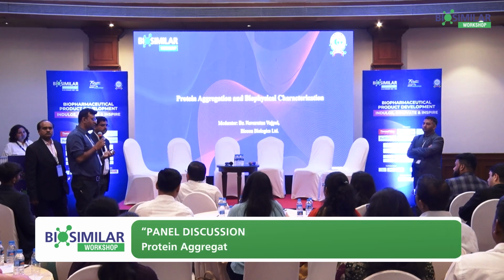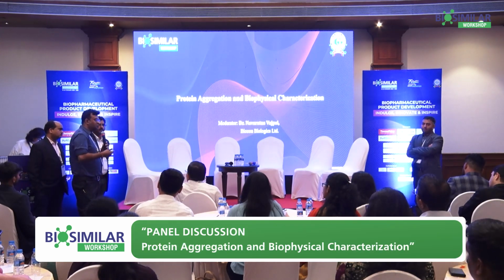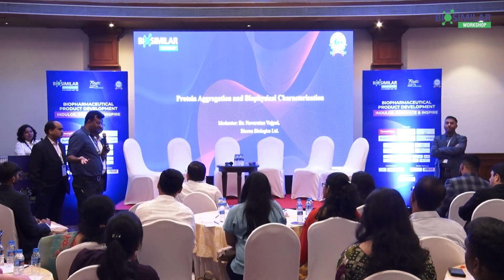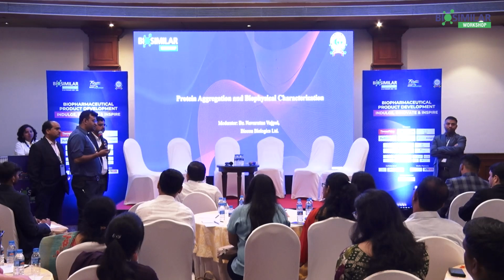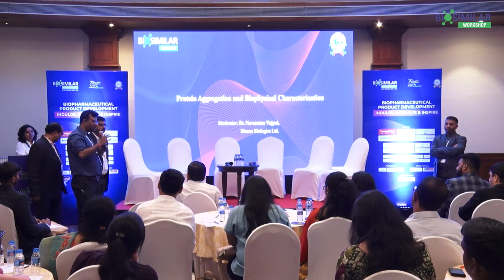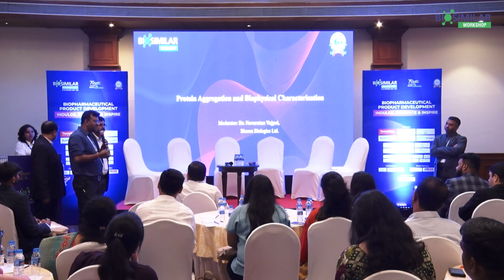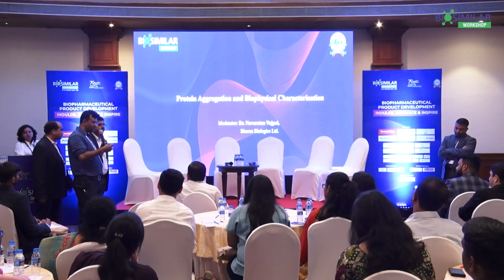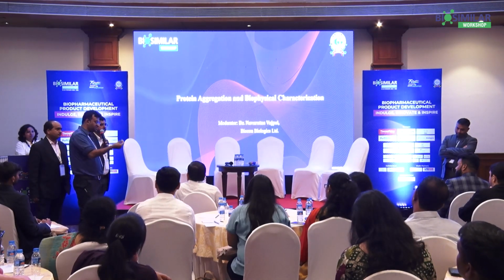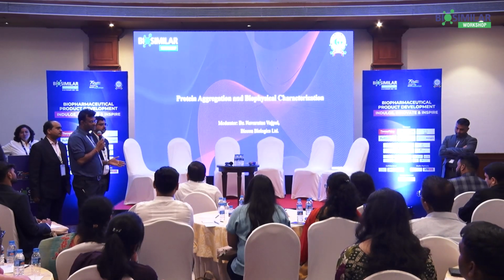You can also evaluate for specificity, because nowadays there are tools being developed even in the software assessments. We spoke about alpha beta assessments. Nowadays people also see area overlaps. Although this is a qualitative assessment, they will see how much area is overlapping, and the percentage of area overlapping between the RLD and our molecule can also be termed as a specificity for the structural assessment. So yes, it is tricky, but it's not impossible.